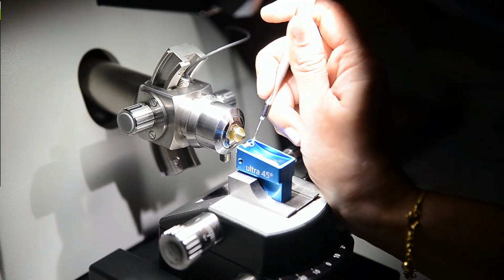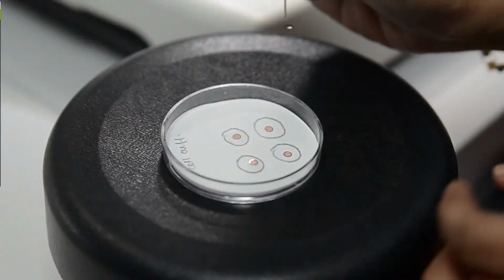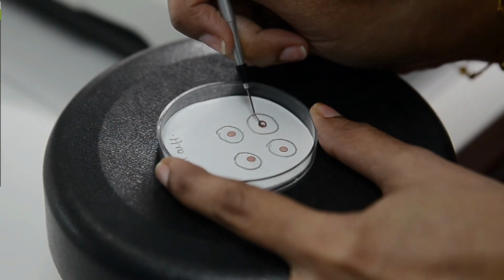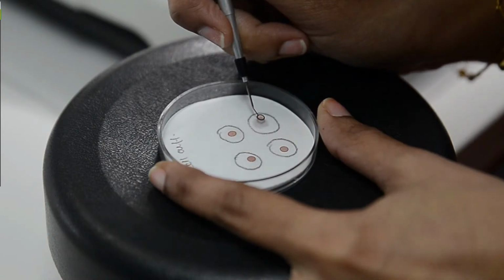And then using the loop, we fish the sections and transfer them to the copper grid slowly. And make sure the section is in the middle of the copper grid.